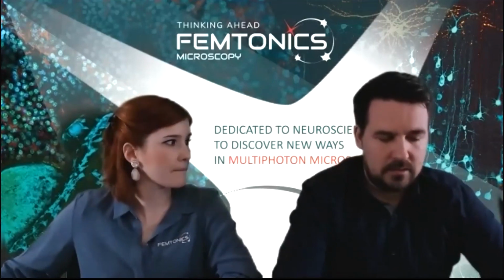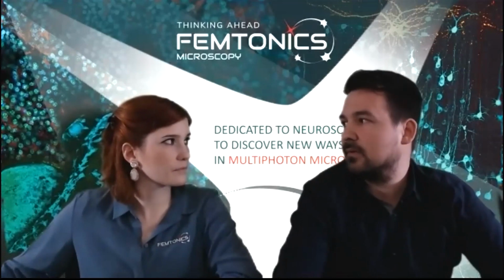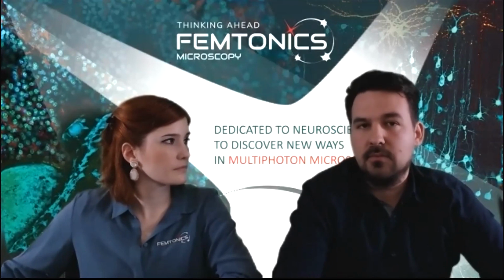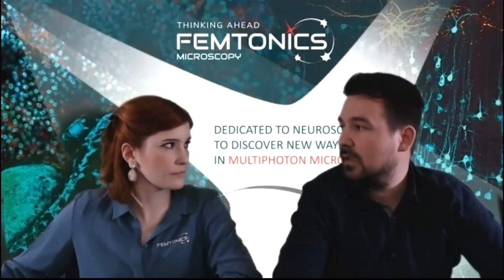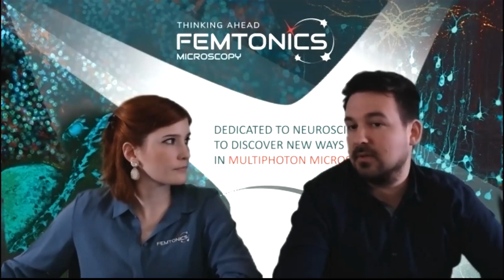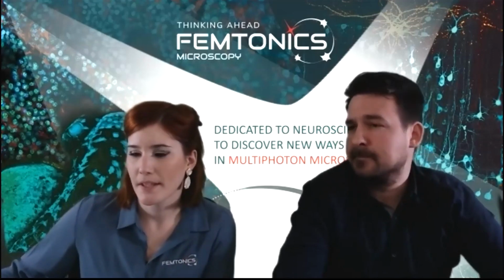And in special cases, you can go down up to almost 1 millimeter with this technique. So, for example, if you are looking for some hippocampal imaging, when you remove the cortex and replace it with a cylinder, then you can reach even the stratum radiatum, for example. Thank you. On to the next one.